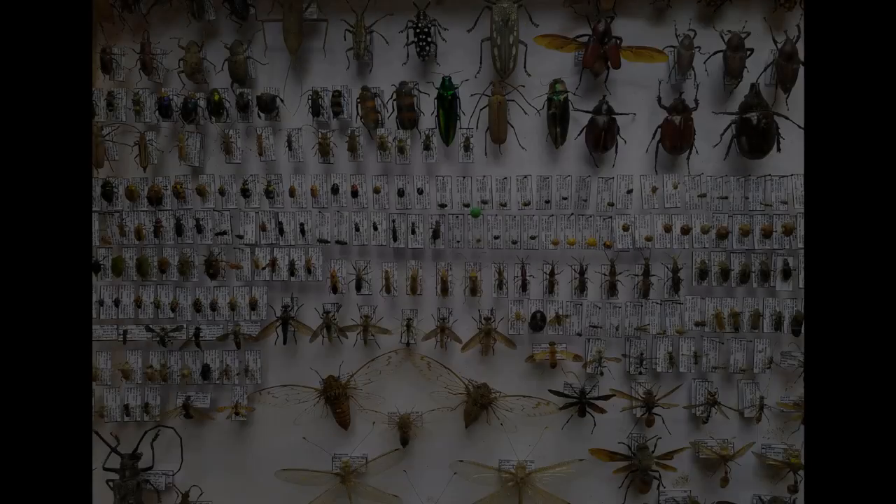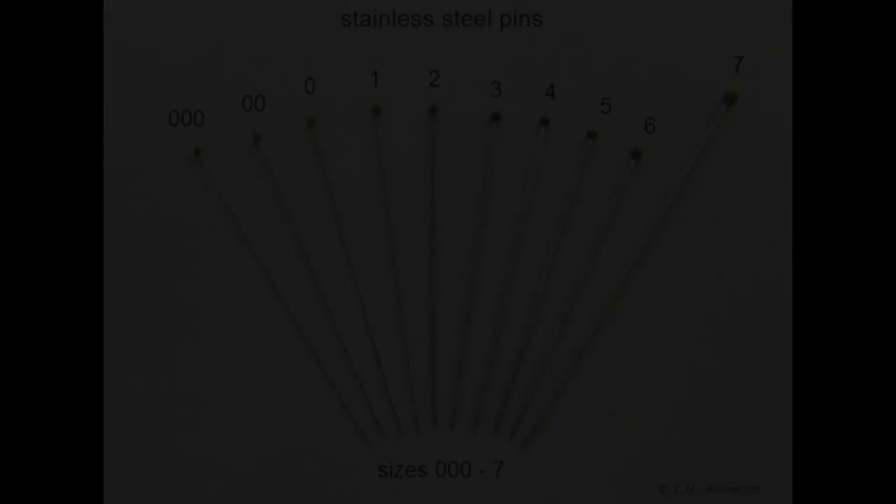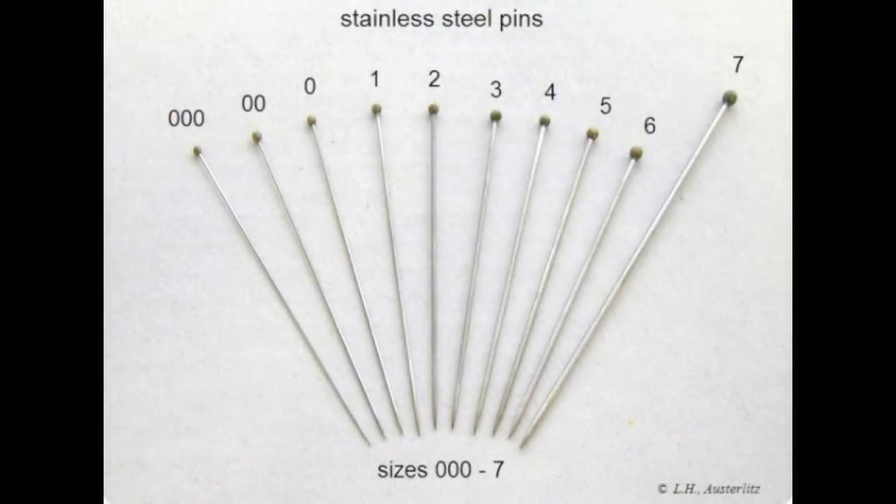Insects are collected and preserved for both education and art by scientists, amateur entomologists, teachers, students, and hobbyists. For pinning insects, special types of pins called insect pins or entomological pins are used.